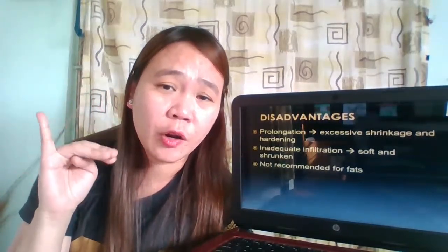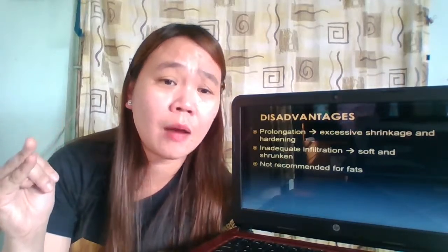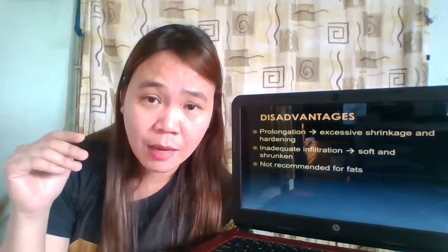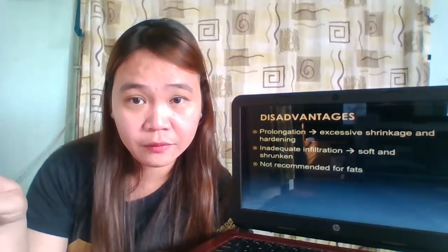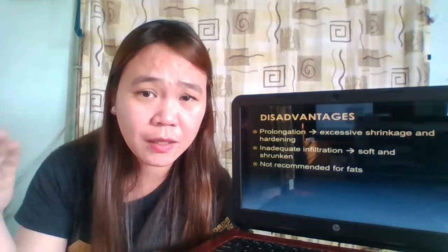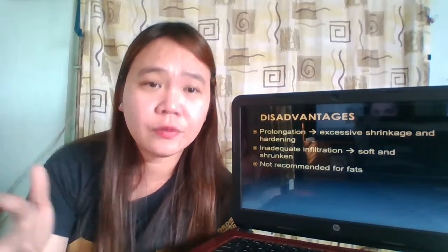There is a medium recommended for bones and teeth. There is a medium recommended for brain samples. There is a medium recommended for eye samples. Not paraffin, because prolonged immersion is needed, and you cannot perform that in paraffin impregnation.